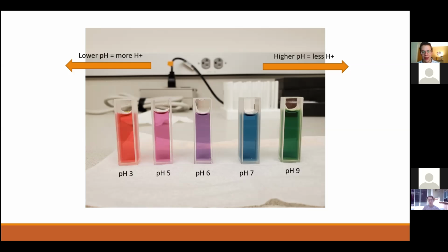And this is probably my favorite picture that I did take from this whole project. So again, lower pH, we get reds. Higher pH, we get greens, and everything in between is just like, this is a difference of 1 pH, and look at that color difference. Like, color is so fun. And so observing this is good.